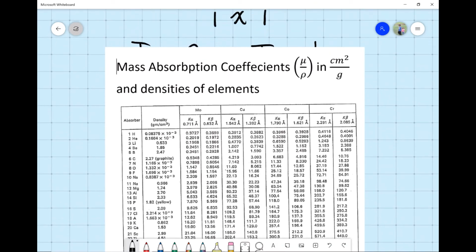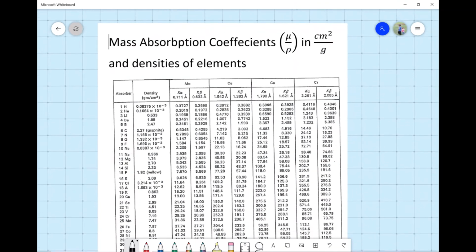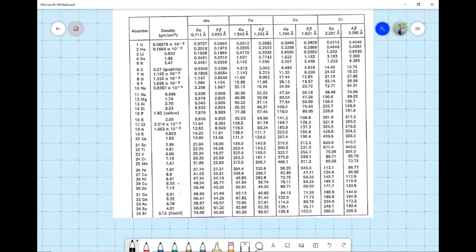And I covered up my equation here. Boom. And I think this is big enough. We can also zoom in. So we have our different values we want. Our absorber, in this case, is going to be iron, and we're dealing with cobalt K alpha, if we go back and look. So cobalt K alpha. These are the critical parameters we want to look at here on our table.